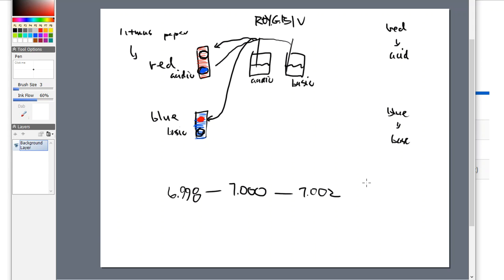So if it's a true pH of 7 solution, if my probe is working the right way and my meter is calibrated, then that is the very tight acceptable window that this probe and meter will give me. So pretty darn good, if you ask me. But most of the time, again, we report pH with 2 decimal places. That's pretty much it. That's pretty standard.